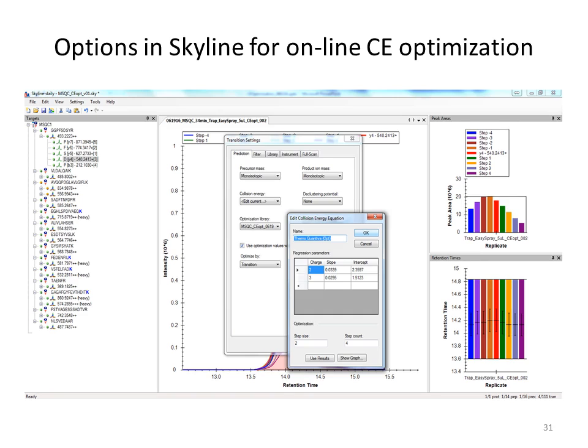Right. And then here are the settings you would set if you wanted to do LC optimization of your collision energy. Step size is in volts, how much you would vary the volt step to generate that breakdown curve. And the step count is on either side of what this equation predicts. So the equation predicts the red bar. This is a response using the default collision energy from the regression equation. And here we go up by 2 volts: 2, 4, 6, 8, and down 2, 4, 6, 8. So we span a range of 16 volts.